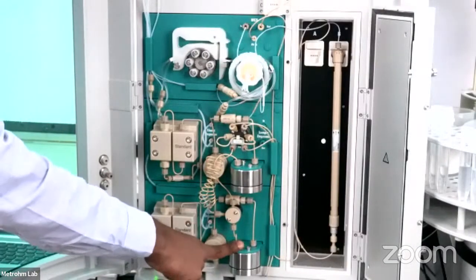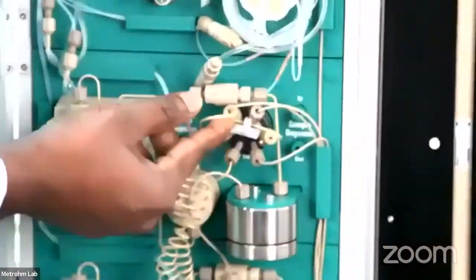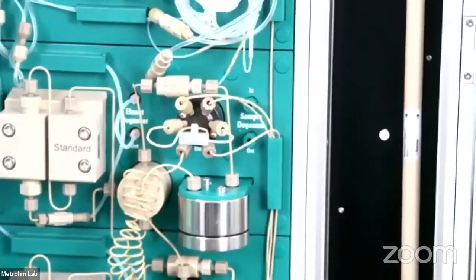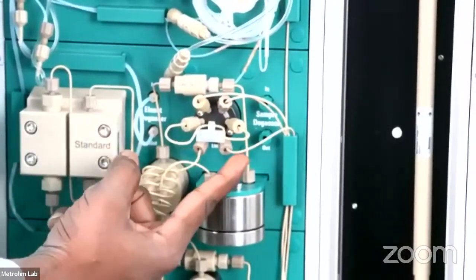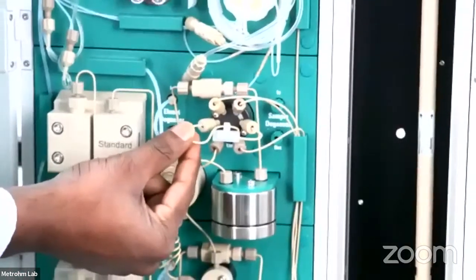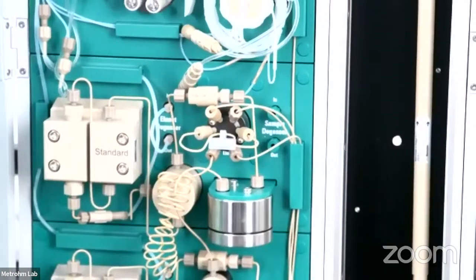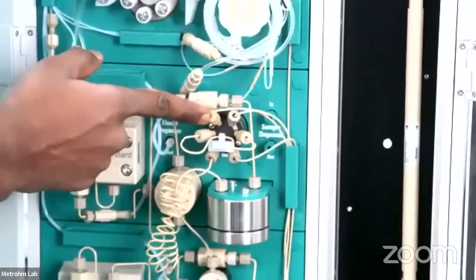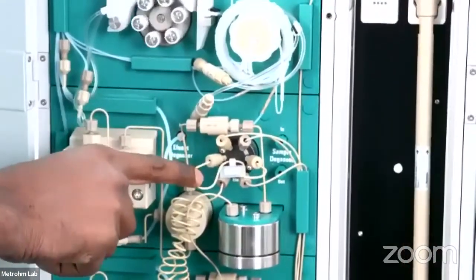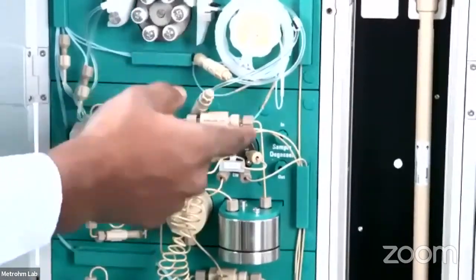After this pulsation dampener, it is connected to the injector. So this is our injector, you can see the 6-port injector. Here only we are introducing the samples. You can see it is eluent in and eluent out, and this is the sample loop. The sample loop can vary from 10 microliter to 1000 microliter based on our sample concentration. The other 2 ports are sample in and sample out. So here only the sample is introduced. Once the sample is injected, the eluent will carry the sample to the column.